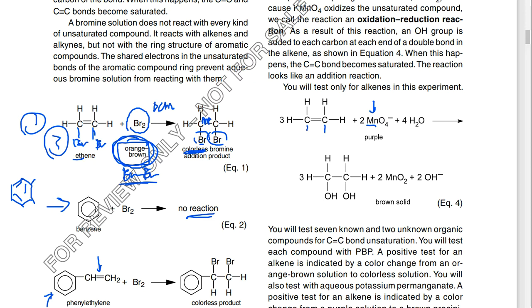And what we see with permanganate is that it reacts with water, and two OH groups go on to the double bond involved in those carbons. We almost form what we call a diol. A diol: di means two, ol means alcohol, and they are side by side. So, permanganate is another colored reaction.